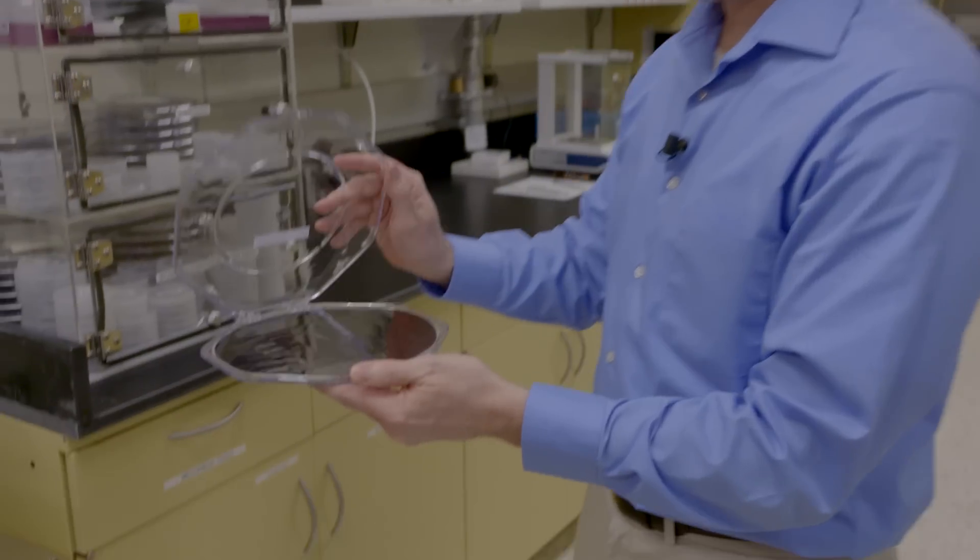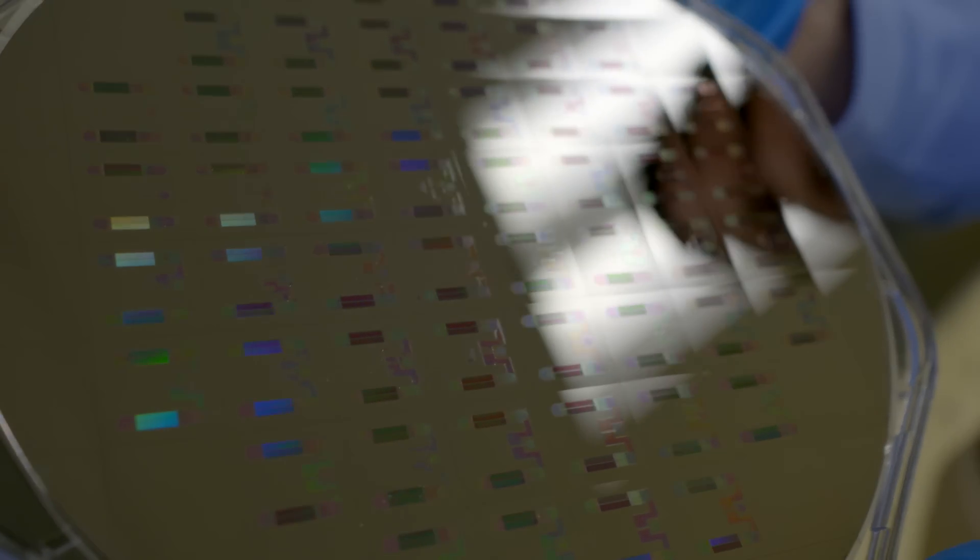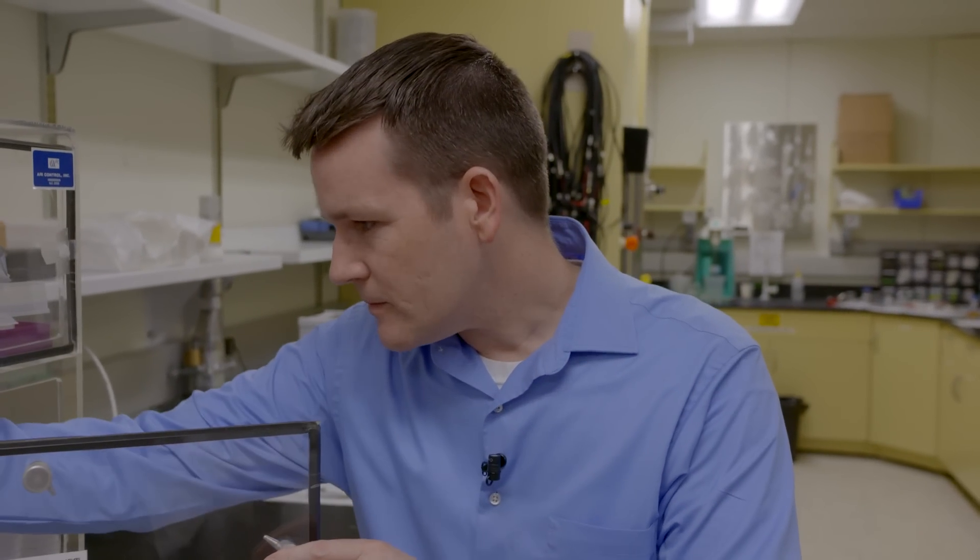What you're seeing here is a diffraction-type effect. These have not quite been prepped yet, so they have kind of a rainbow effect to them. The idea is that we want to flow fluid through these chips — and that could ultimately be a human sample, either a blood sample or a urine sample — something you could use for diagnostic purposes.